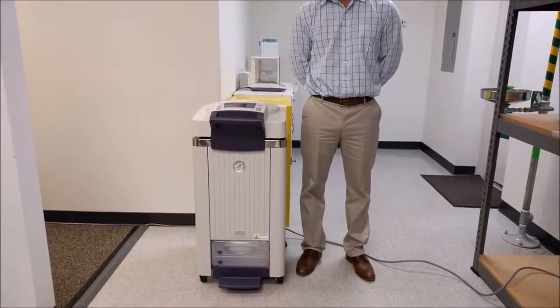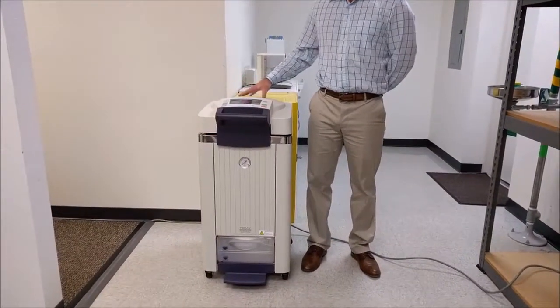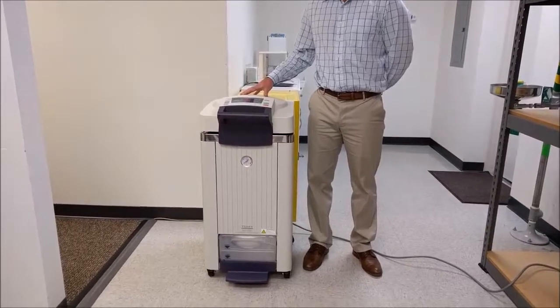Hello, my name is Pat with Amusa, Inc., and today I would like to present the Tomy SX700 Portable Autoclave. Despite its small footprint, the chamber has been maximized to 69 liters in this model.